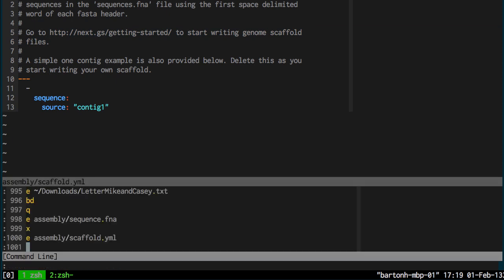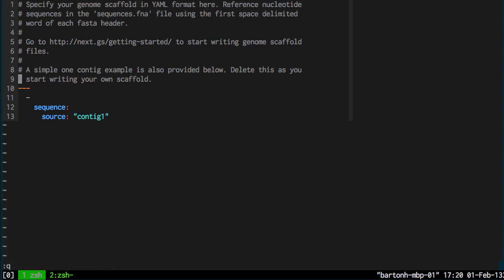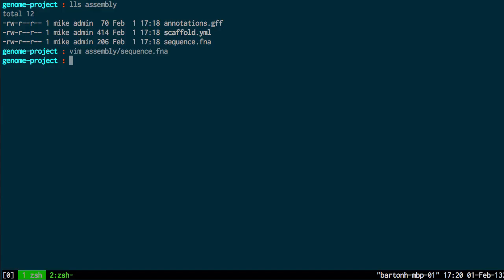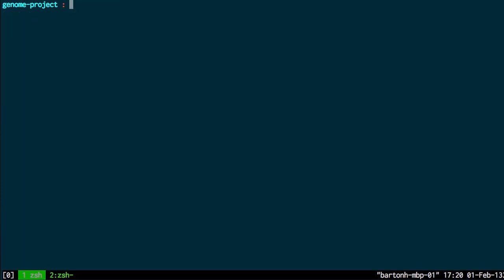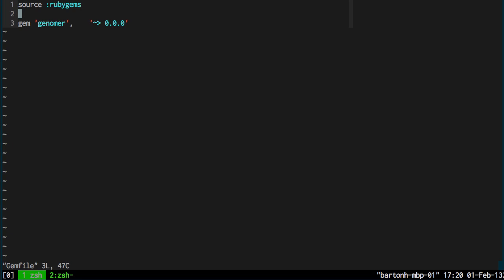So to start using Genomer I need to install the plugin because at the moment I only have two commands and none of those are useful for working with the genome scaffold so far. And so that's where the gem file comes in. So if I edit this gem file it specifies what Genomer commands I have installed in this project. So I'm going to add another one and that is genomer-plugin-view.